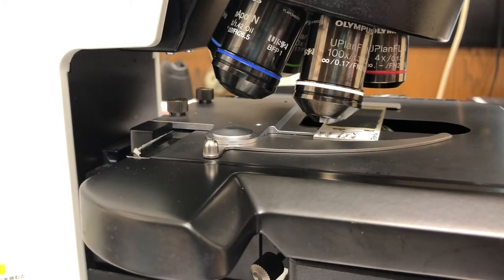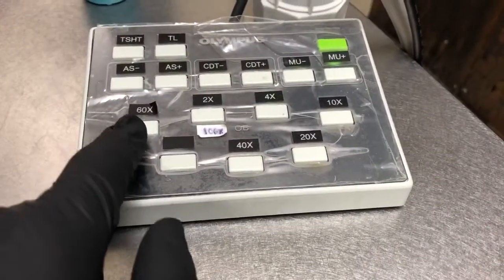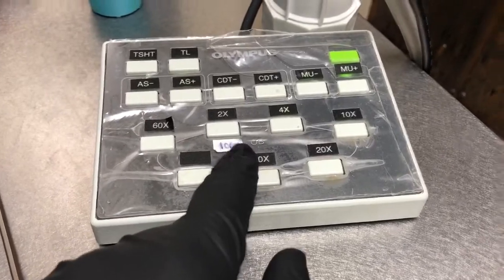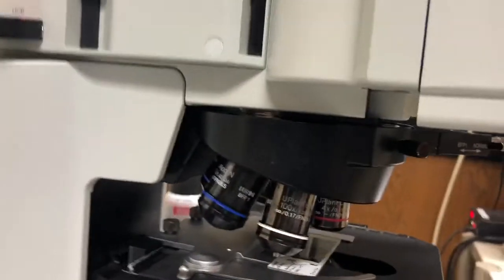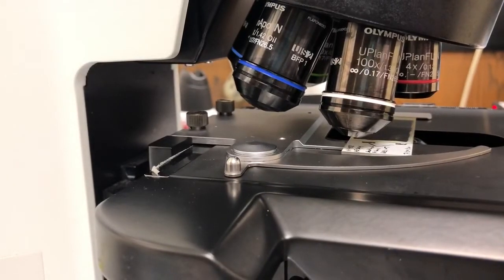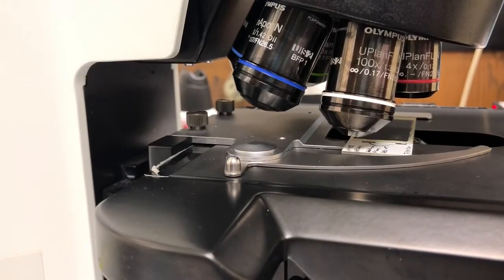The first thing you need to do is check if the oil objectives are actually on the microscope. To do that you can go to the 60x or 100x position or just look on the microscope itself and see if you can identify the 60x and 100x objectives if you need one of those two.